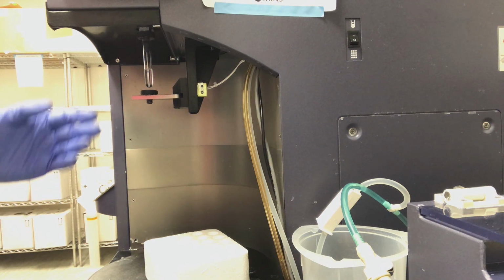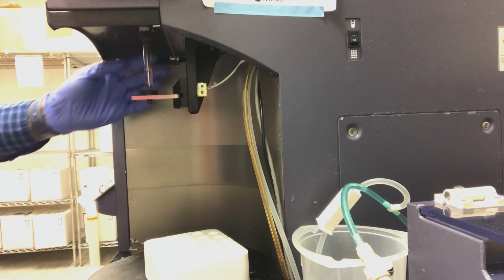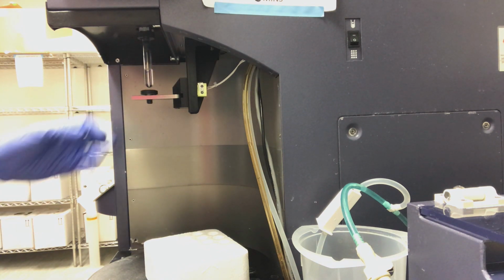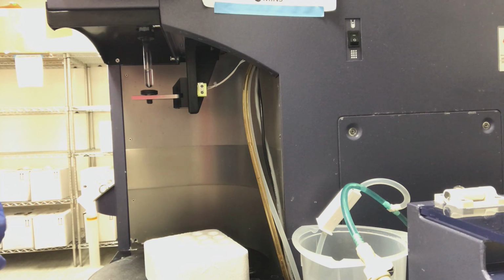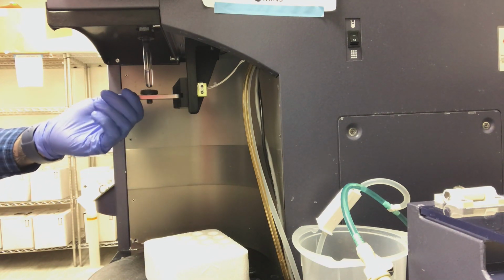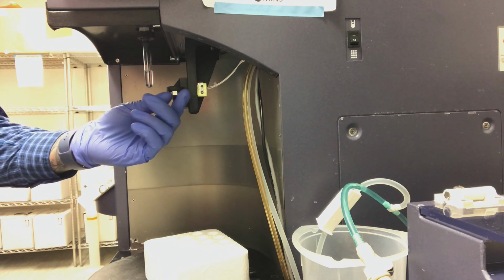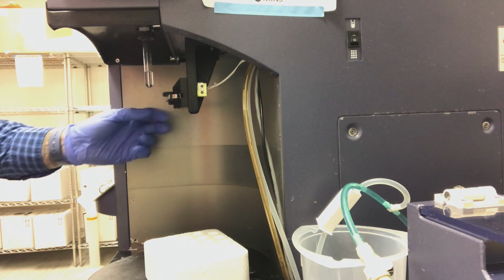you can see the way that the machine is set up here is a little bit different than the Canto 2. You can see that there's actually a tube loaded with water. This remains on the probe to keep the probe lubricated because there is no backflush that exists on the Canto 2. Another difference is this arm is not spring-loaded and can move in both directions. Please be careful as you move this back and forth that you do not catch the probe and bend it.